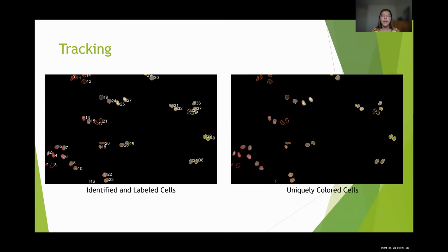And then moving on to tracking, KIT GE, their method used nearest neighbors. They created a custom MATLAB toolbox because this is a greedy method and they were working with large data sets. I recognized that, so I scaled their method down a bit. So instead of looking at multiple nearest neighbors, I just looked at the nearest neighbor.